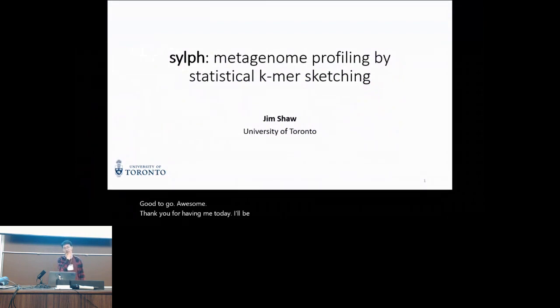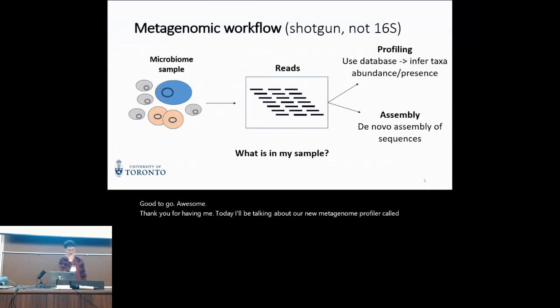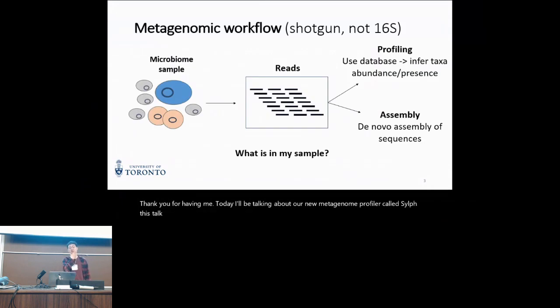I'll be talking about our new metagenome profiler called sylph. This talk will be about metagenomics, in particular shotgun metagenomics, so not 16S. And in general, what we do is we have a microbiome sample that we're interested in studying, like the gut. We sequence it, and really we want to ask, what is in my sample? That's the key question. And we can do this through a couple of methods.